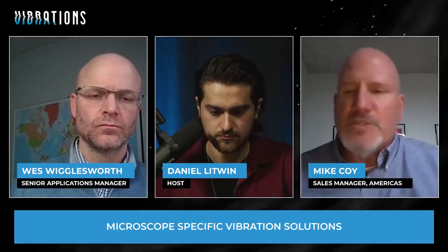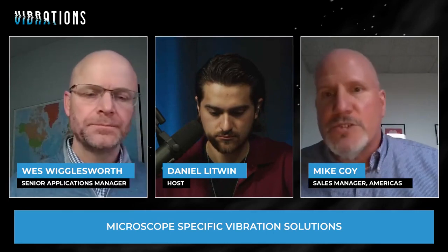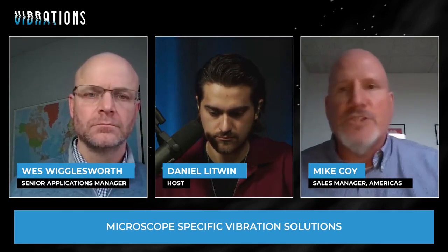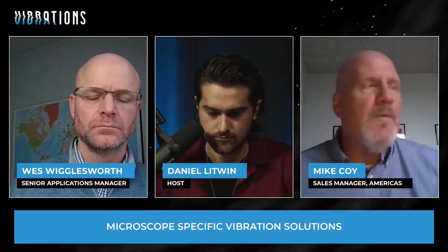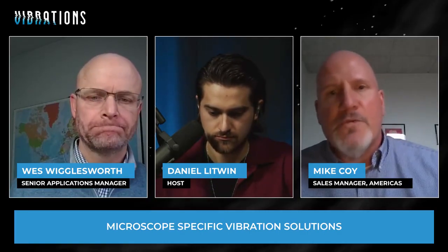So like Wes mentioned, with an optical microscope you're limited by the wavelength of the source, which is light in this case, so your magnifications are fairly limited. A very basic vibration control system usually is enough to get them through to that point.